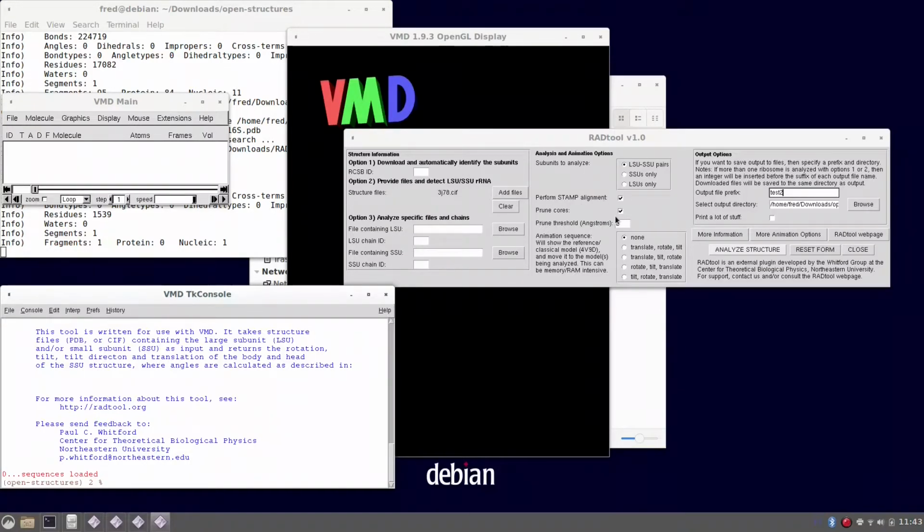Stamp will reorganize the numbering, and depending on your computer capacity, these steps could go from some seconds to a couple of minutes. And in my case, I'm using an old laptop, so yeah, we have to wait for a while.